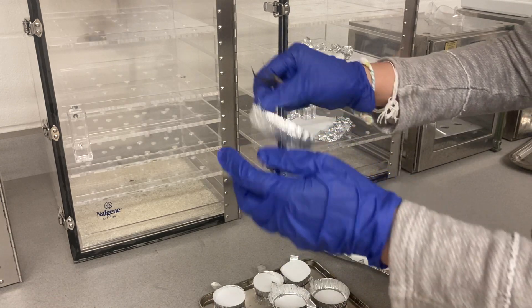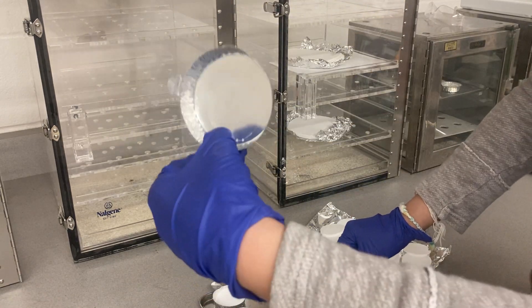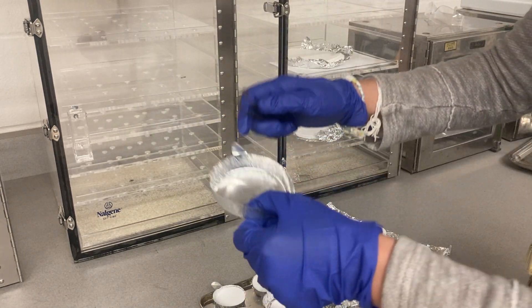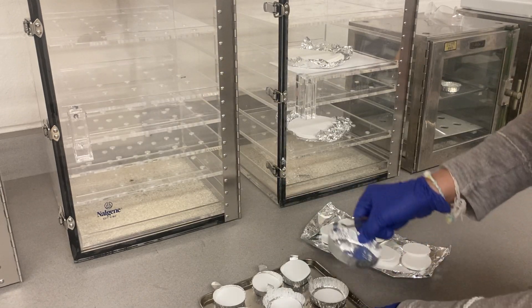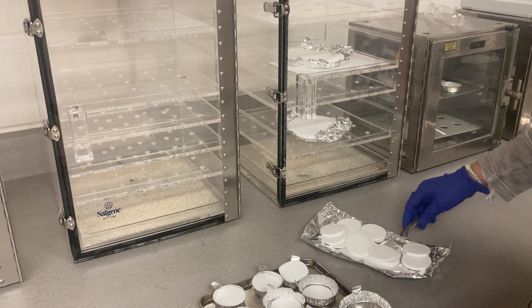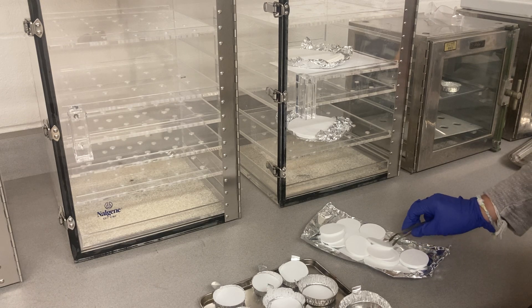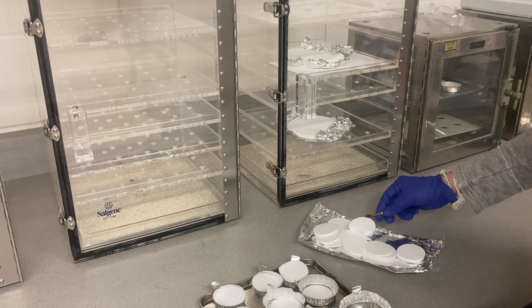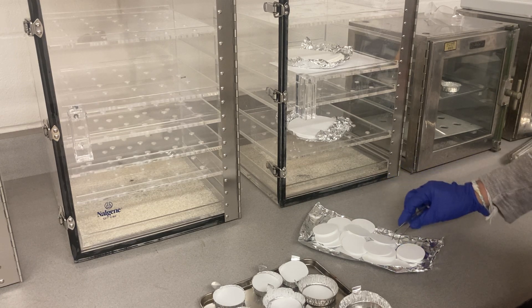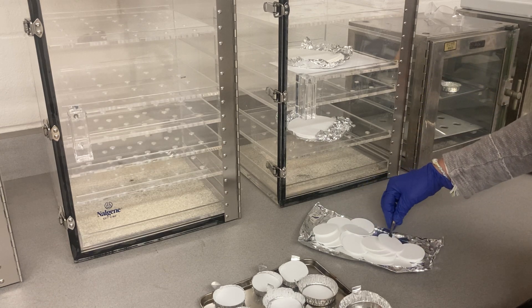Some students mark it differently, but I do it like this. Replicate one looks like this — straight. Replicate two looks like this — folded once. Replicate three looks like this — folded into a U-shape. So each replicate has a distinct visual mark you can recognize.